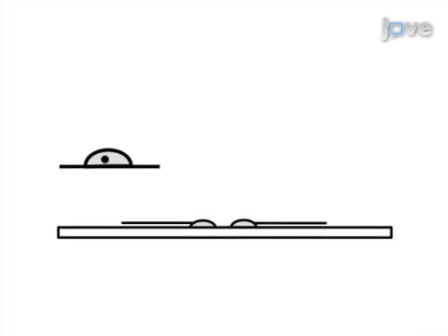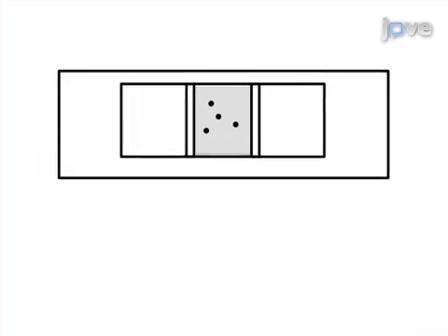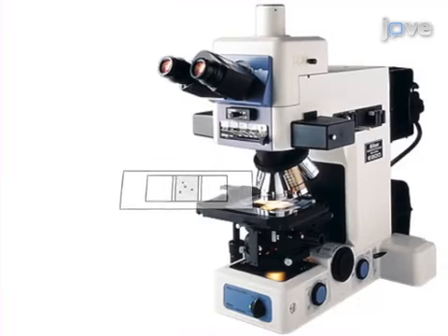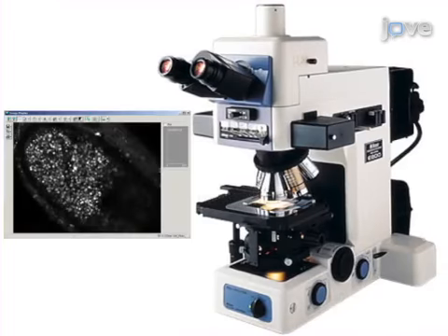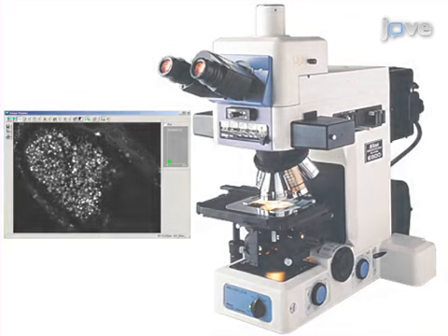Then isolate the individual oocytes and invert the cover slip over the channel in the prepared slide to create a viewing chamber. After locating the oocytes with bright field or DIC optics, capture digital images at set time intervals using confocal microscopy and associated software.